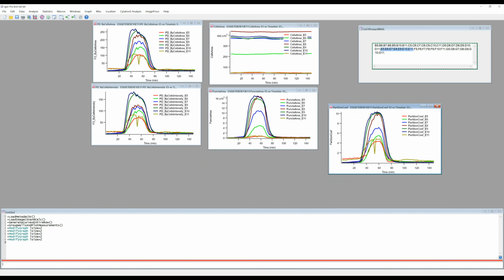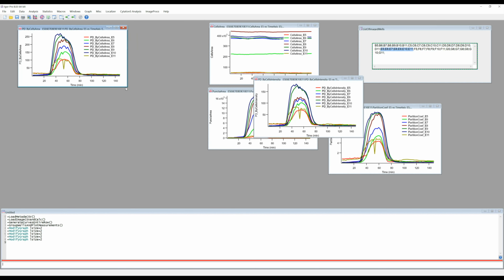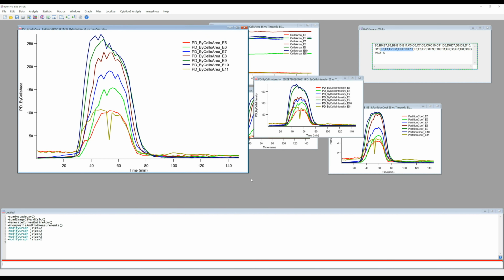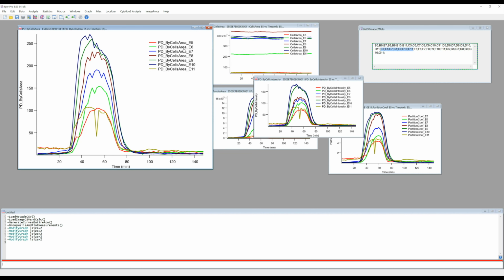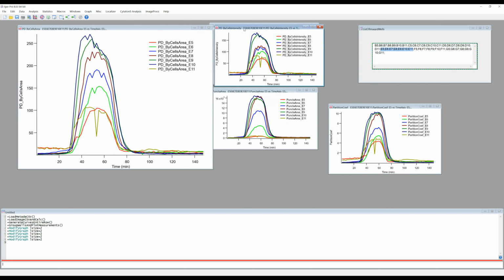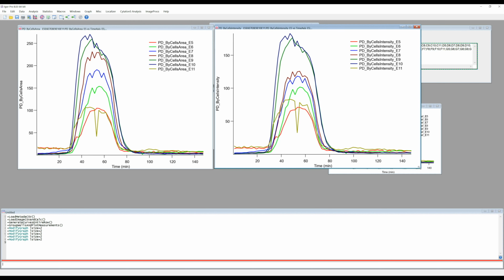Now, I want to make another point, which is about puncta density measurement. As you know, we do this in two different ways. One is by dividing the number of puncta by the area of the cells, which we call puncta density by cells area. And we can also calculate this by dividing the number of puncta by the signal of the cellular area.